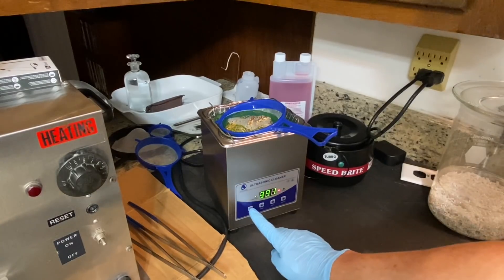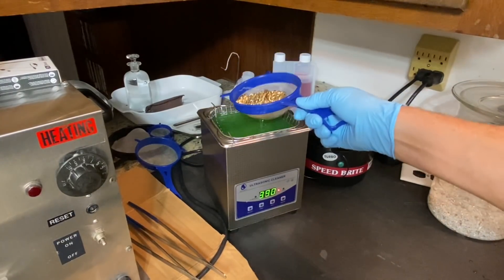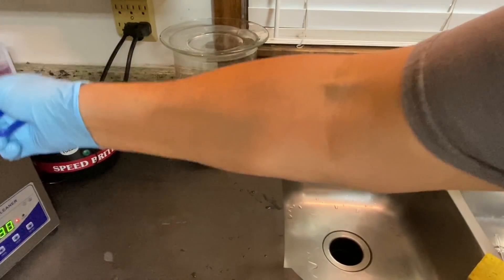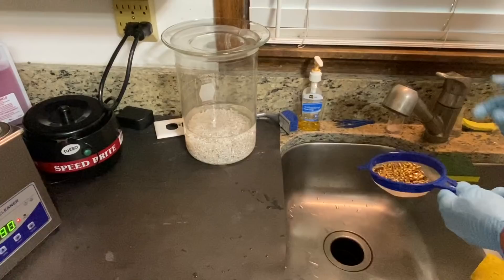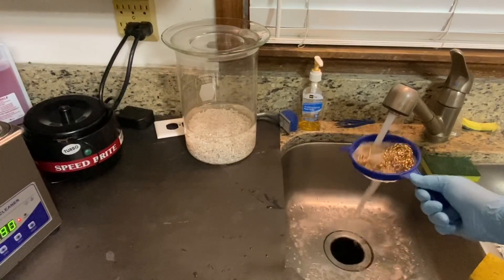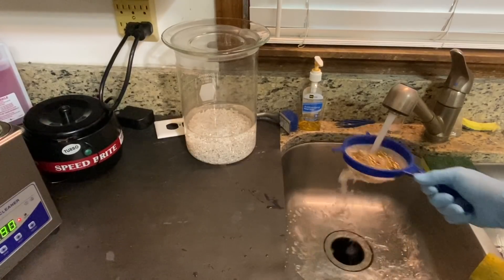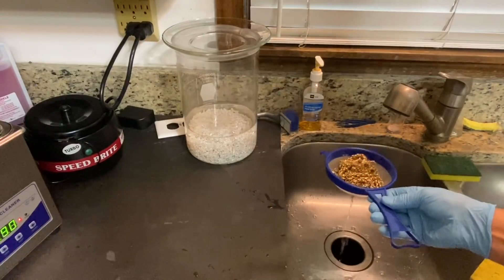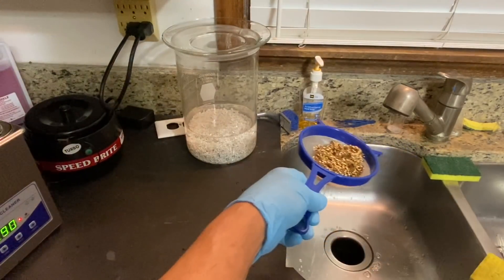This has been in here about five minutes now. What I'm going to do is run it in some clean hot water to get all the soap rinsed off of it. Okay, I've got all the soap rinsed off.